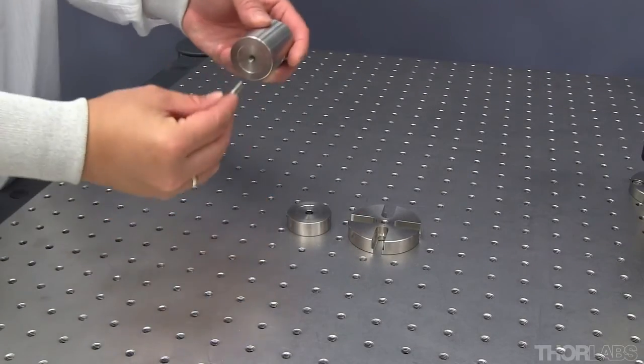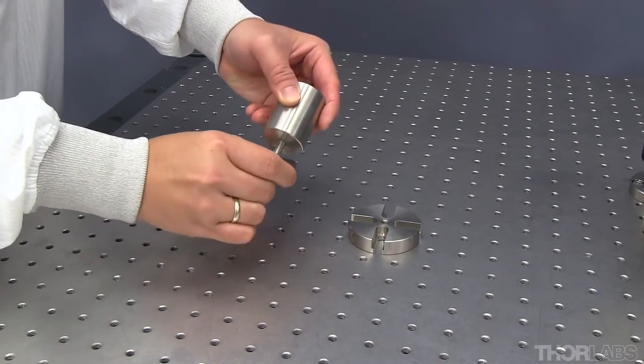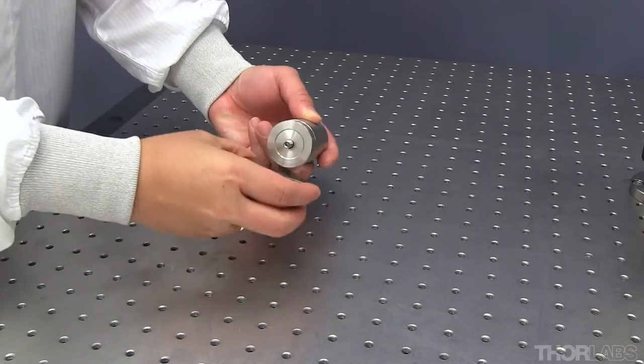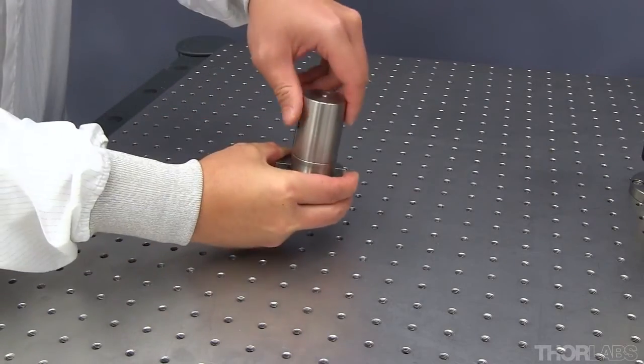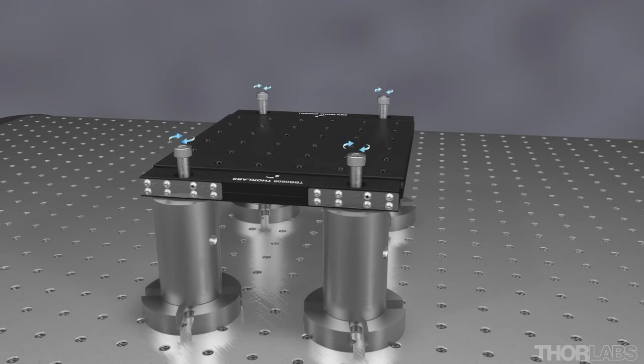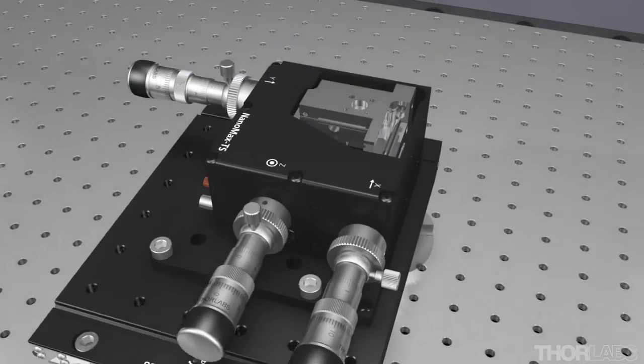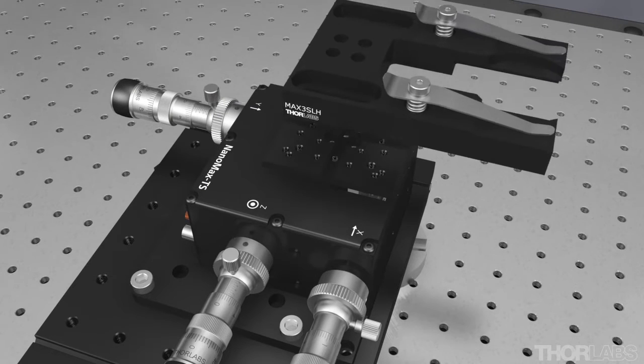Each support post is composed of a post, a spacer, and a base. Using the set screw, assemble each post as shown here. Mount the translating breadboard to the 4 support posts. Then attach the NanoMax translation stage to the breadboard. Finally, mount the slide holder to the translation stage.